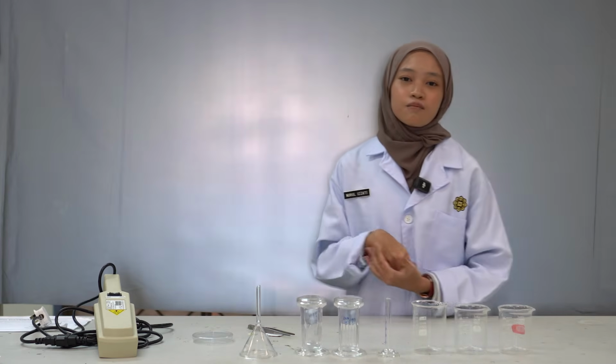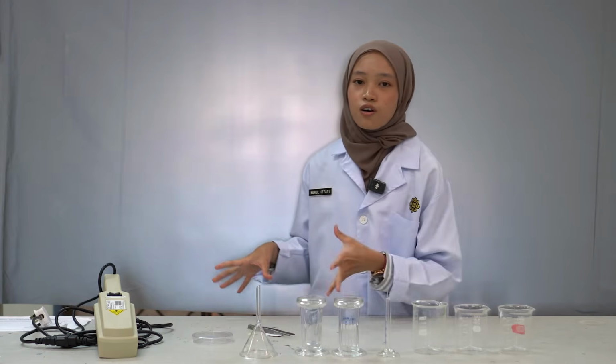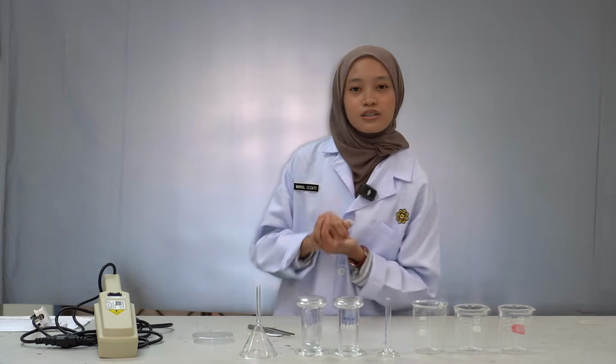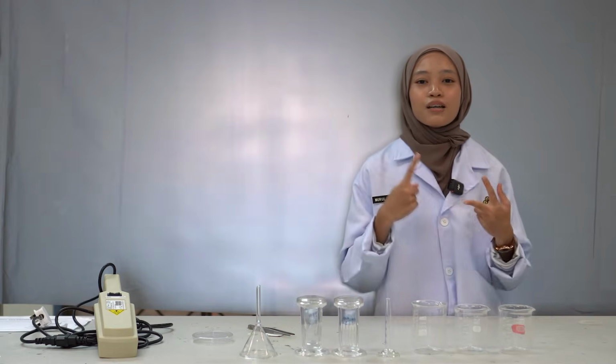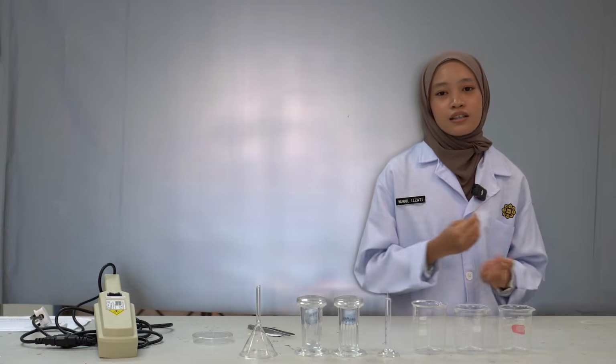Let's move on to the next application, which is in biochemical analysis. In biochemical analysis, TLC is used for isolation and separation of biochemical constituents, and constituents in blood plasma and blood fluids for clinical analysis and clinical research.